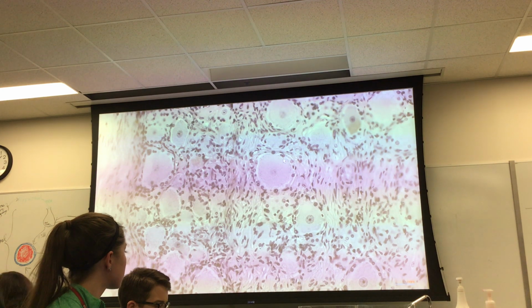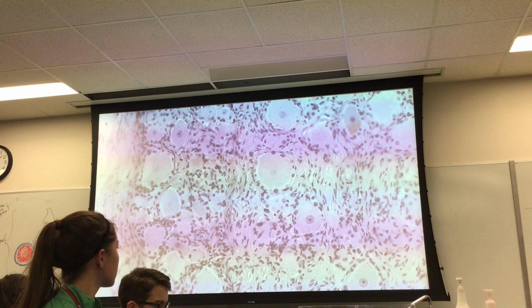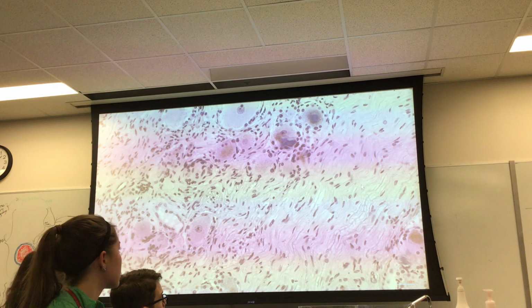Satellite cells. Good. And then these guys out here, what are those called? Schwann cells. And remember we said that the cells and the fibers are segregated? Well, that means there's big fiber tracts in between the cells. So again, I'm not saying these are all wonderful examples, but here's an area you would never see this in an autonomic ganglion.